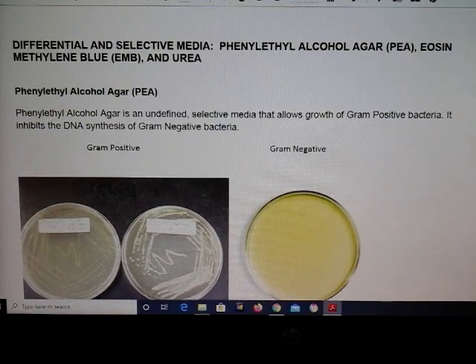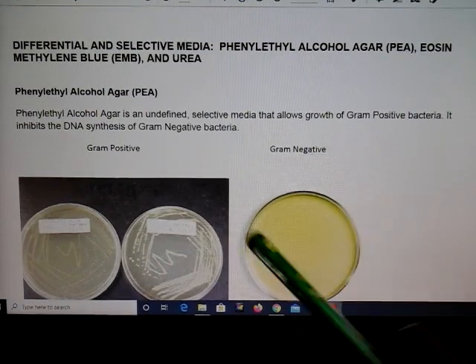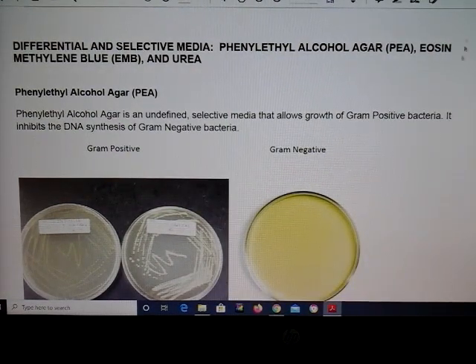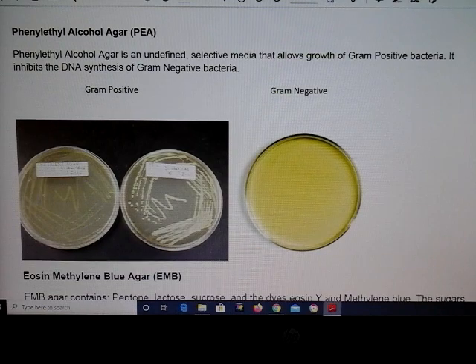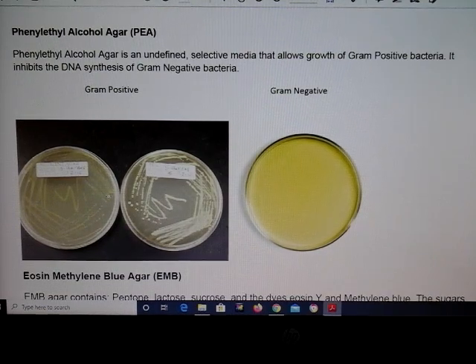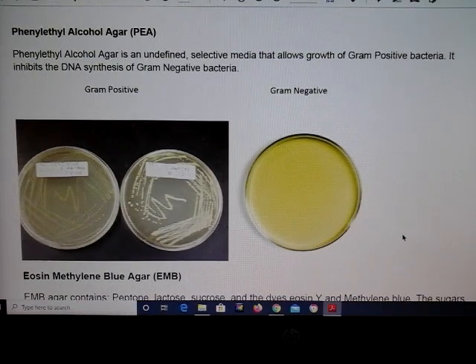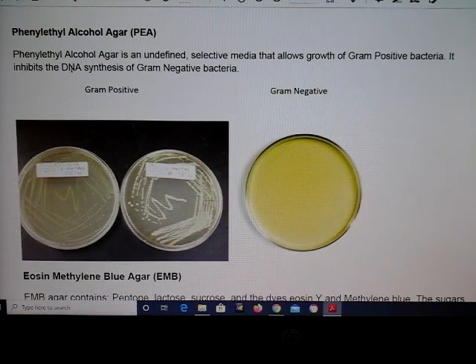The first type of testing I'd like to discuss is a PEA plate, or phenyl ethyl alcohol agar plate. This type of plate will inhibit the DNA synthesis of gram-negative bacteria. As you can see in the picture, on the left are plates of Staph aureus — they grow quite well on PEA. However, gram-negatives will be inhibited or sometimes show no growth at all. Occasionally some aggressive gram-negatives may still grow, but the key point is inhibition of DNA synthesis.